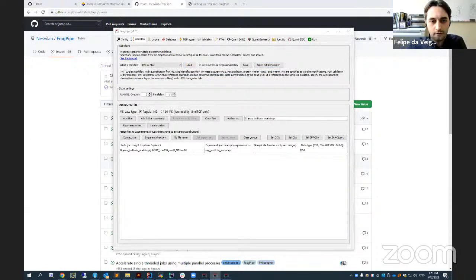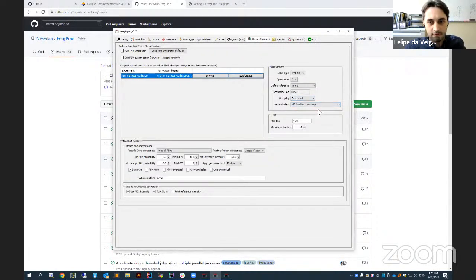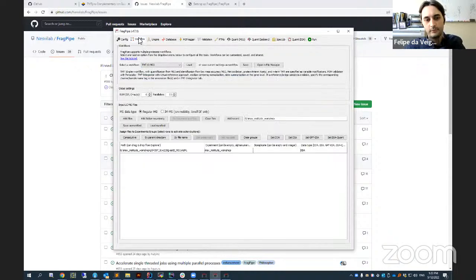Yeah, one other detail, since you came back to this screen here, there are a couple of buttons that are called Save Manifest. If you go back to the workflow, we usually recommend people save their experiments and their settings. If you click on Save Manifest, that will save the list of files that you used in your experiment. That's always a good thing, because if you want to come back later and try to remember what you did.